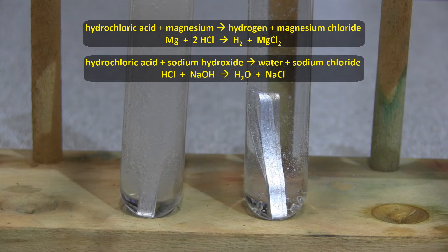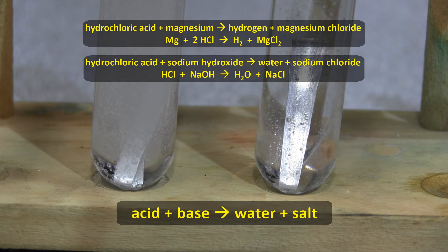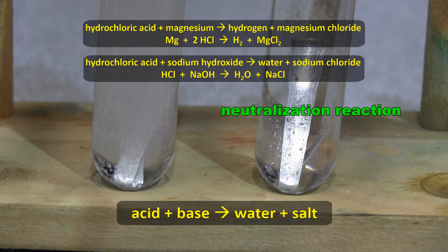The acid has chemically reacted with the base, so now I just have a piece of magnesium lying in a test tube that has water and salt in it. So, in general, an acid plus a base produces water plus a type of salt, and this is called a neutralization reaction.